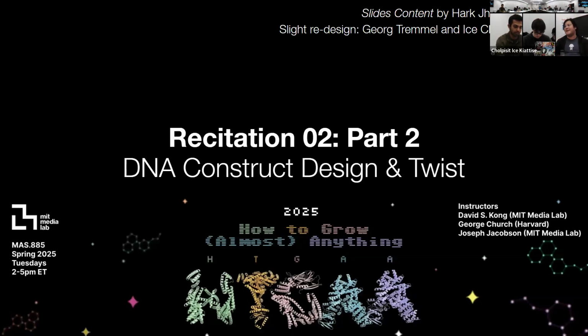If you know from the database what kind of DNA you have, these days the DNA write technology can make the DNA for you without having to secure the original DNA source. They allow you to make 1K or something bigger in that direction. So this is one of the potentials of DNA write, apart from just being able to read or do things in silico. You can do it for real. You can get the tube that has the DNA of your interest.